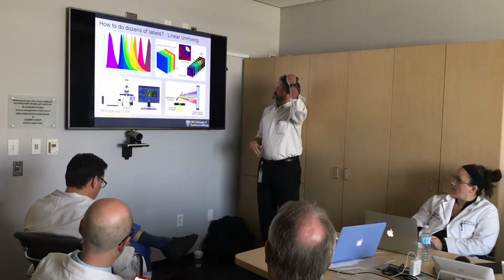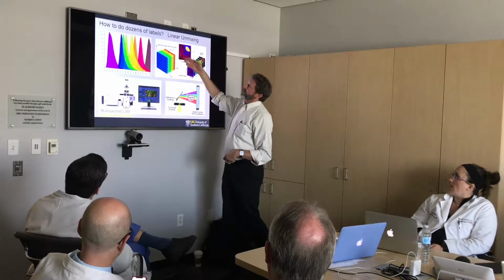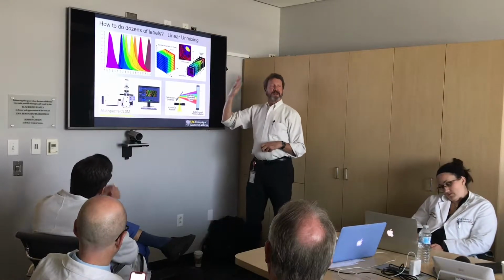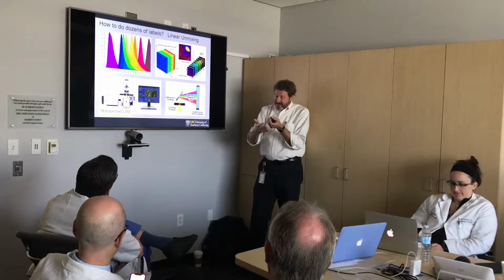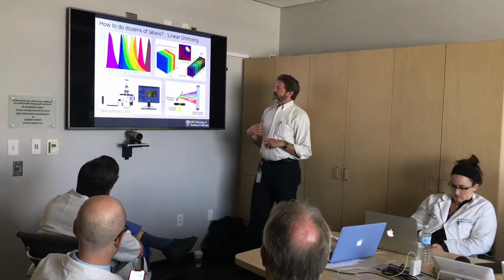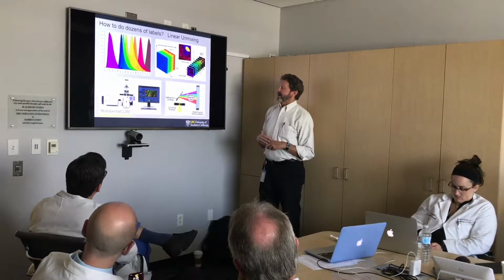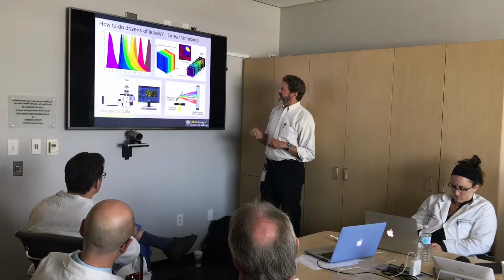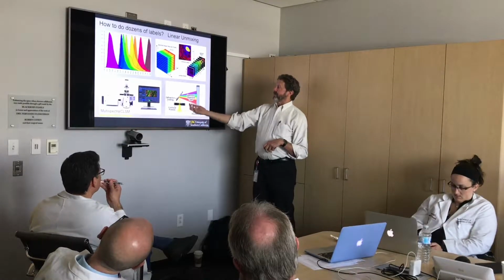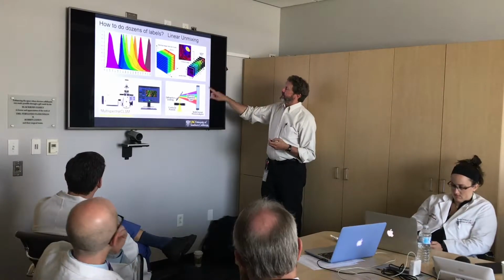And so they started sharing with me the ways that they collect an X, Y, and then the third dimension is wavelength. So an image cube that's a spectral cube. This lambda stack then can be interpreted to see what the combination of things are in each pixel. So we worked with them first to make a prototype. It ended up being a thing that developed into an instrument that Zeiss has been selling for the last decade or two. And basically it's taking the laser light to excite the specimen, collects the fluorescence that comes back, and disperses it over 32 channels.